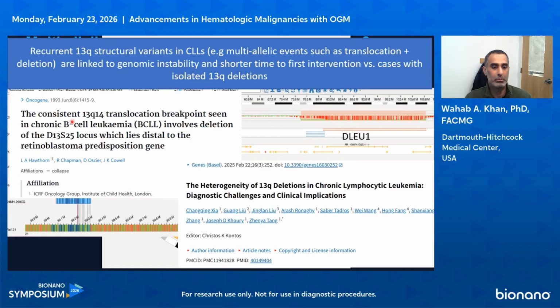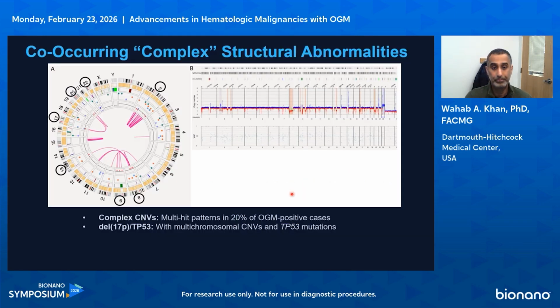Historically, we've seen this in the past where there were instances described of these 13q14 translocation breakpoints in B-cell processes involving CLLs. And then this here speaks to the heterogeneity that one can see in these 13q losses in CLL, which we also saw in our cohort.